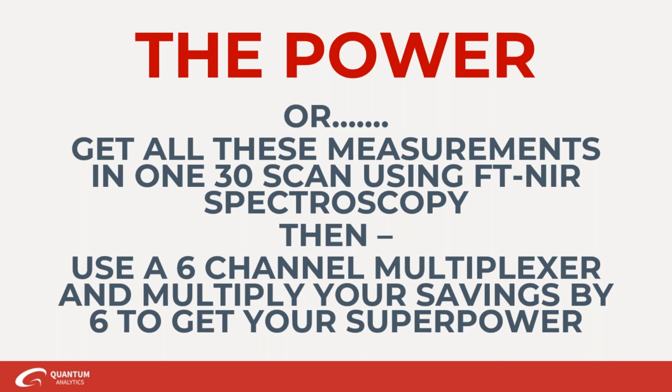But also, just sitting down, getting your samples, and creating a first model, and then you take a look at those statistics. You look at your R-squared, you look at your prediction error. You take that model, and then you get some new samples, scan the spectrum, and do prediction. With this software, you can do offline predictions pretty easily, and I mentioned the cross validation, where you actually pull some samples out as you're making the model. You can do that once you have your model.